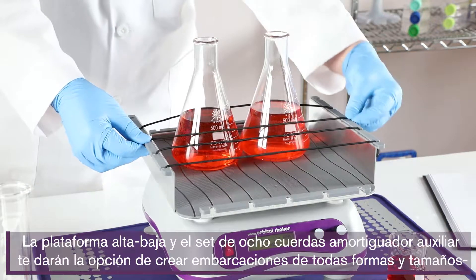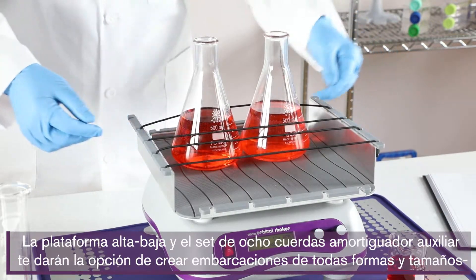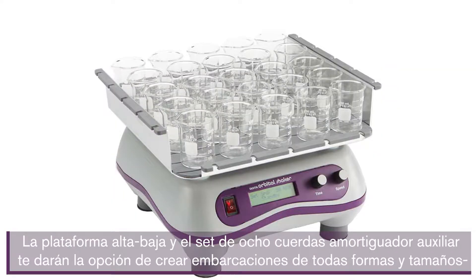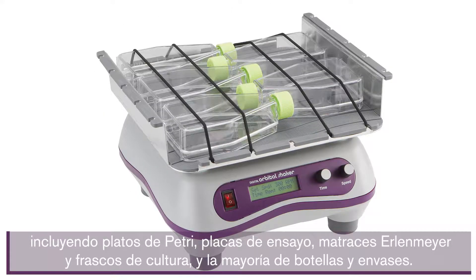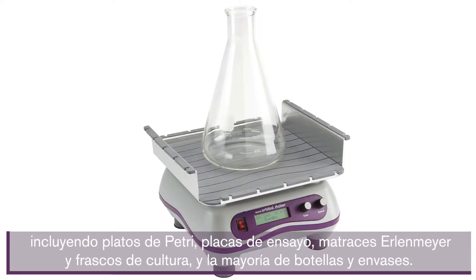The universal high-low platform instead of bungee cords gives you the option to secure vessels of all shapes and sizes, including petri dishes, assay plates, Erlenmeyer and culture flasks, and most bottles and containers.